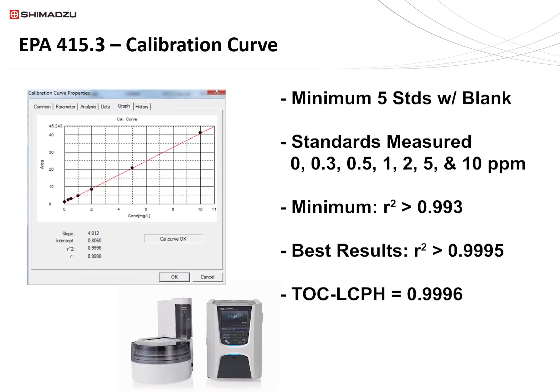The first requirement is to create a calibration curve with at least 5 points including the blank. The calibration curve here was performed on the Shimadzu TOC-LCPH. The curve consists of 7 standards including the blank to ensure linearity.